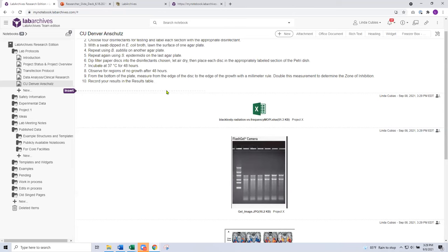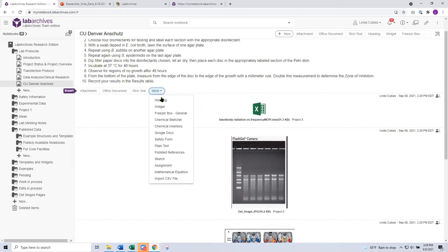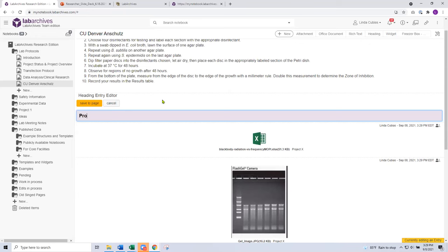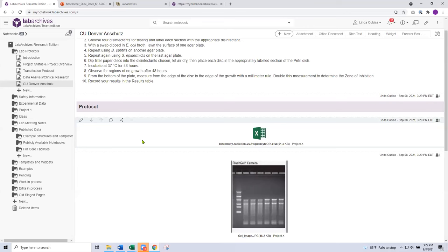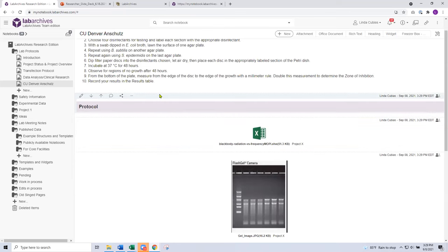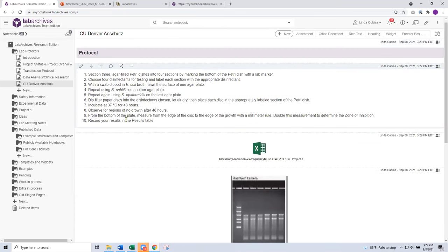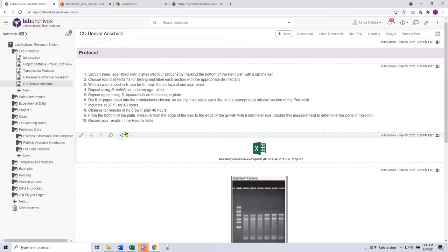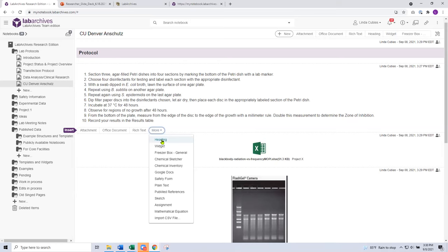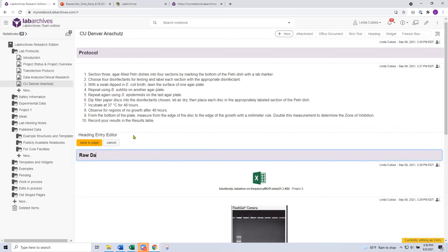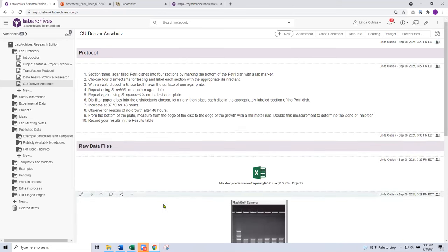I have my Excel file, a gel doc, and a few other image-based documents on the screen, each with their own unique name, date, and timestamp. Another common entry type would be a heading. Now that I have multiple entries on the page, if I hover between entries I can use the insert flag, which lets me direct where I want my next entry to go. I want a heading, and let's say I want to call this 'Protocol.' Headings are a great way to separate the content on the page and organize it. I can use arrows to correctly reorder entries — putting 'Protocol' at the top, and then adding an additional heading called 'Raw Data Files.'